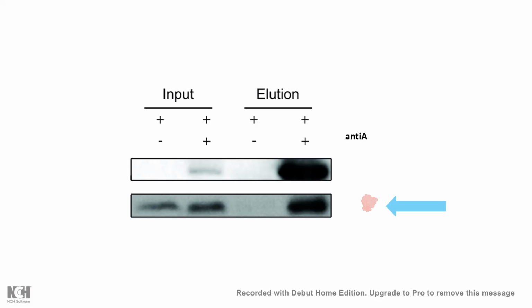So you can see we wanted to understand whether protein A interacts with protein B or not. So we need an antibody, and the protein A antibody we have used. So we are confident that we have pulled down the protein A. That is why you can see the band corresponding to protein A, right? Then you want to use an antibody, anti B. Now this anti B is against protein B. So in this pull down fraction of protein A, if B is present and they're interacting with each other, then you would see a band like that, and that's what you see here.